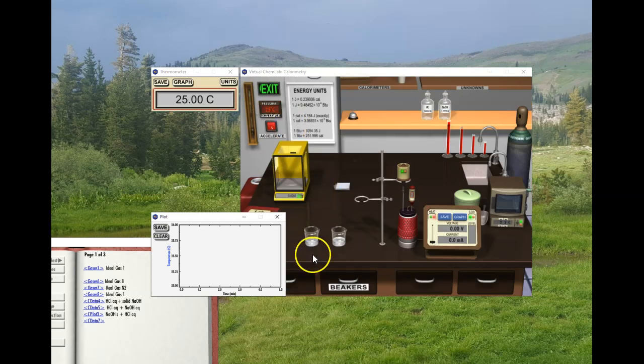So we have our sodium hydroxide and we have our hydrochloric acid, and we're going to put them together in the calorimeter. We have the calorimeter spinning. We don't have any liquid water in here because they're already in water, so when we're done they're going to equal the 200 milliliters total. And so always we're having the same amount of water in here.